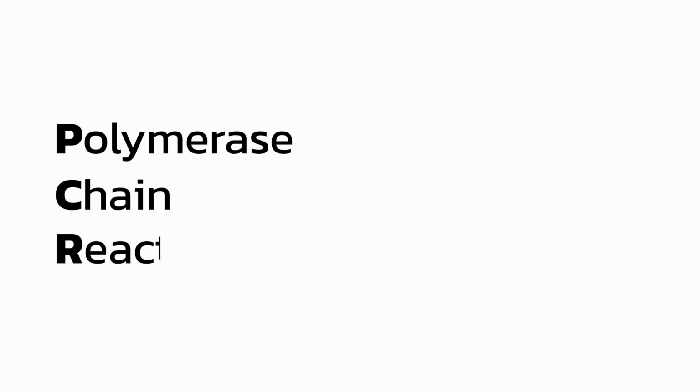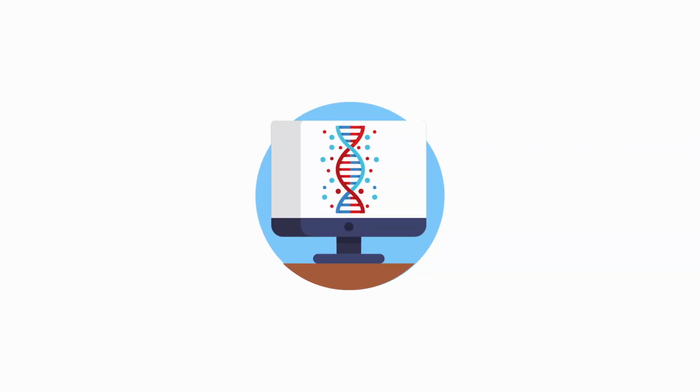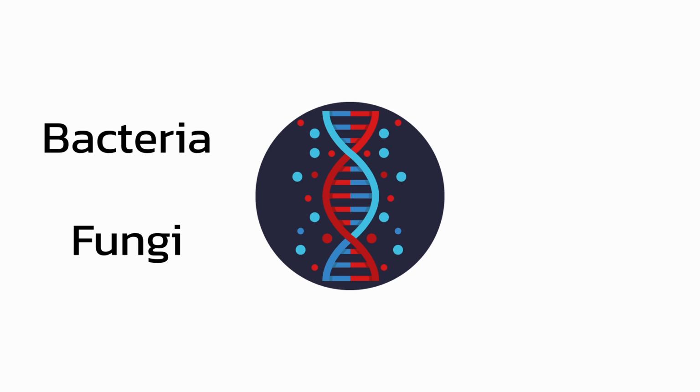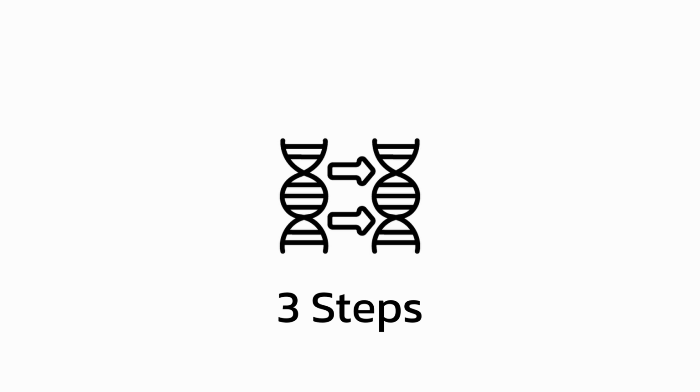So what is PCR? Well, PCR stands for polymerase chain reaction, which falls into the broad category of nucleic acid amplification tests. PCR is a method that amplifies small segments of DNA, which can then be utilized to identify bacteria, fungi, viruses, and other microorganisms in a clinical specimen.